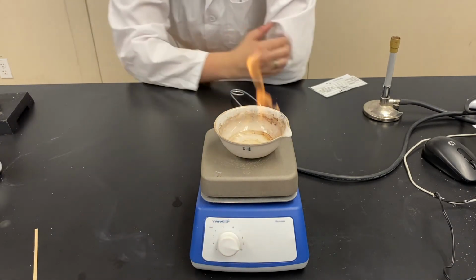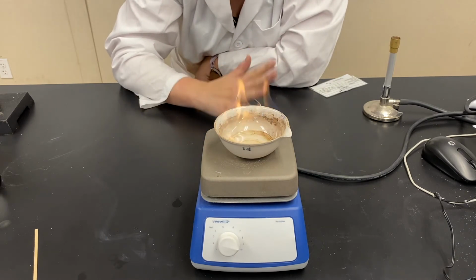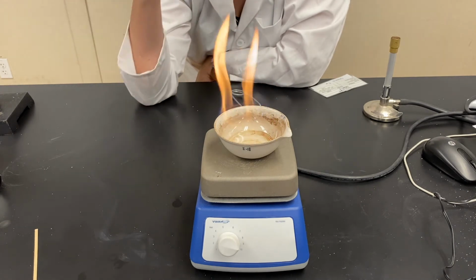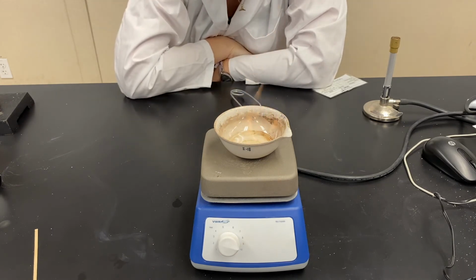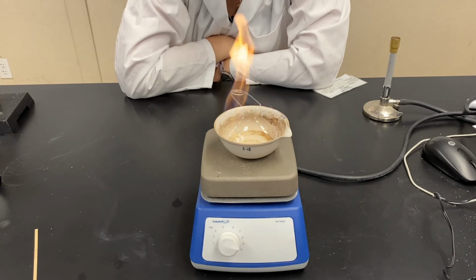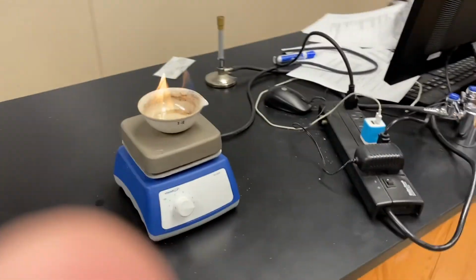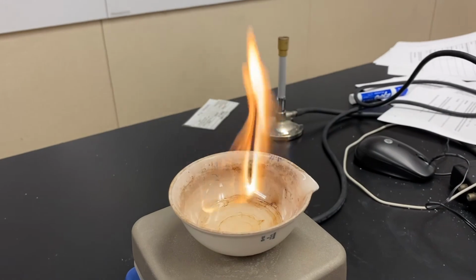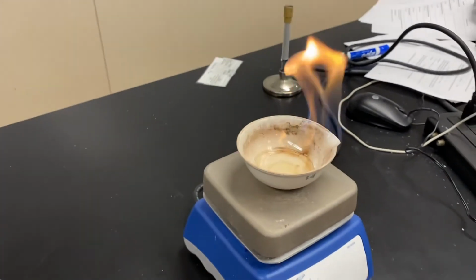And what do you know? It burns. Very exciting. So we have ethanol, which is carbons, hydrogens, and oxygens. And we have oxygen in the air, and it's burning. So if you've ever been to a fancy restaurant and they light your dessert on fire or something, this is what they do. Ooh, pretty. Fire! We'll just let that burn out.